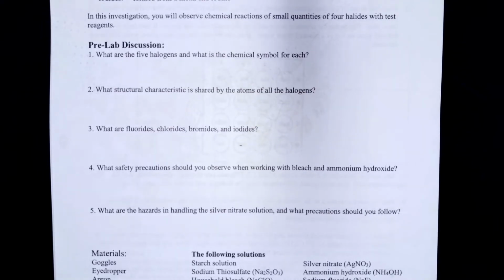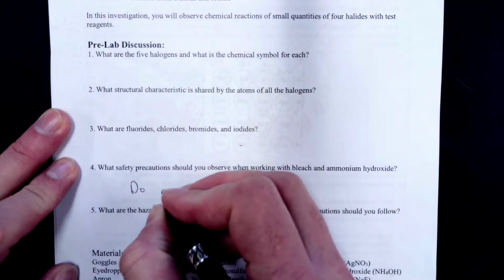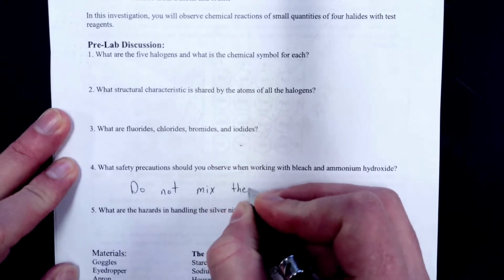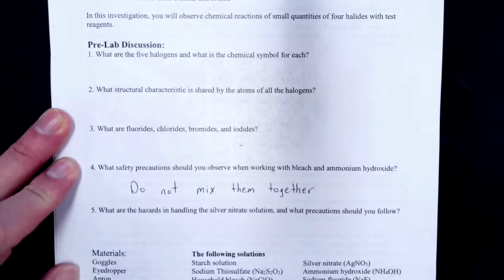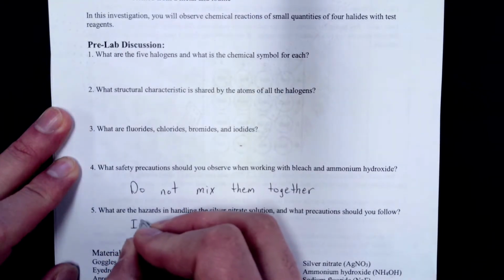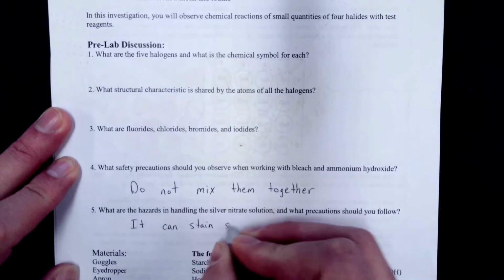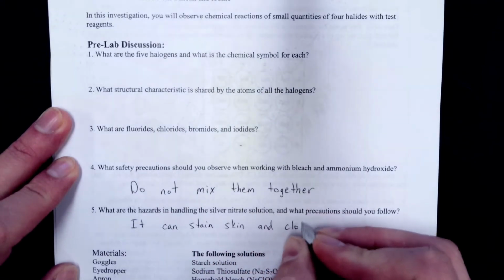But first I'm going to do questions 4 and 5 with you. So when you're working with bleach and ammonium hydroxide, make sure that you don't mix them together. If you mix them together, you can form a chloramine compound, which is very toxic. It's very irritating to your lungs. For silver nitrate, you've used this before, so you know this answer. It can stain your skin, it can stain your clothes, it just stains everything.